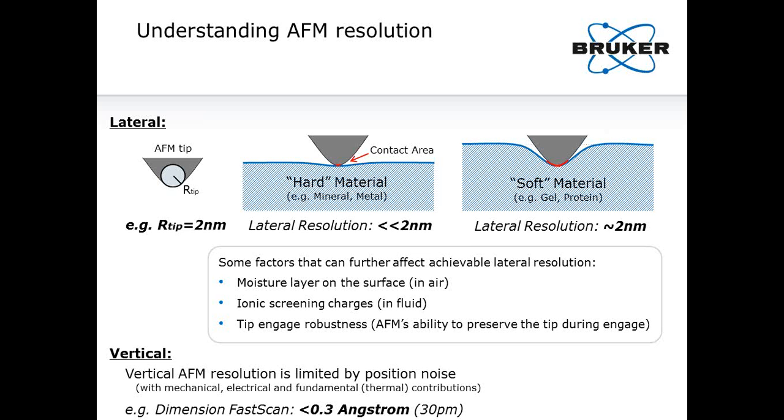Typical values on a good AFM are below 0.5 angstrom and can sometimes reach 10 picometers in the right lab environment. Even early AFMs have achieved similar performances. However, the most recent designs combine this performance level with large scan ranges, direct Z-sensor metrology, and large sample and multi-sample automation capabilities, which is much more challenging. Lateral AFM resolution, on the other hand, is more complicated.